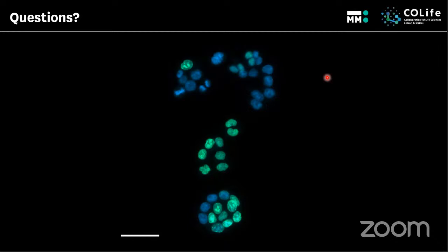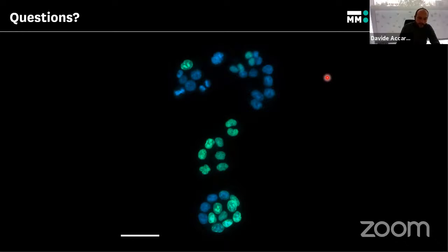Thank you. I would like to contribute on this, if possible, with two things. What Rino said is all correct, but there is also one factor that might help to flexibly adapt the imaging that you can do at the spinning disk, and it's choosing different magnification factors of your lens.